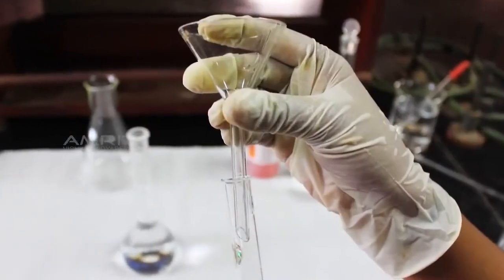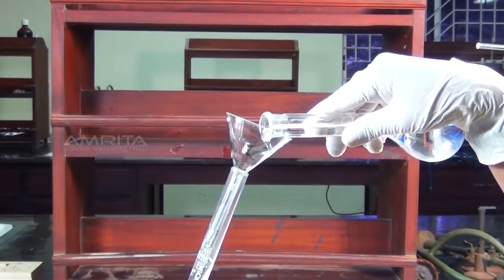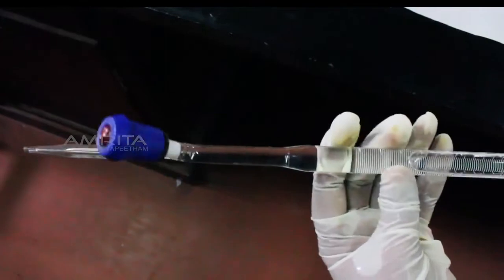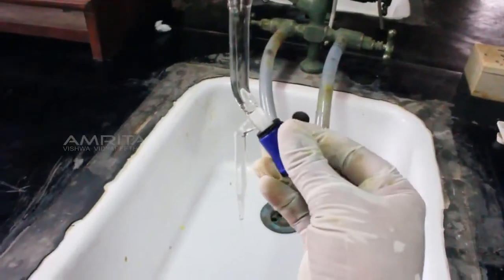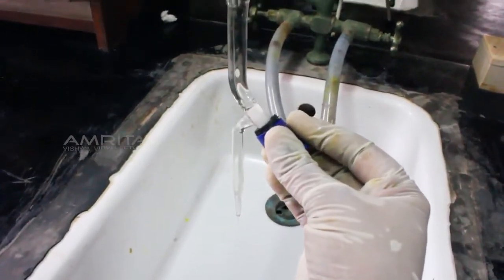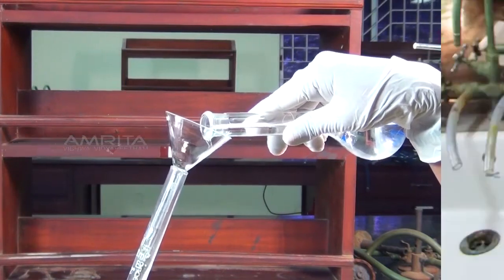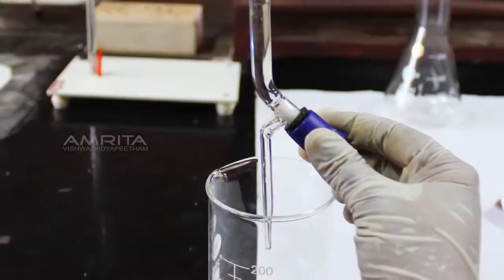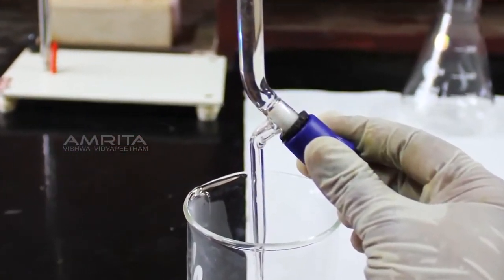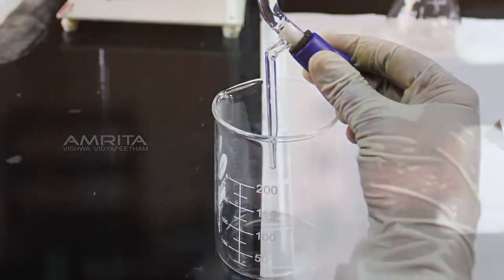Take a funnel and place it over the burette and pour some hydrochloric acid into the burette through the funnel. Rinse the burette 2 or 3 times with the given hydrochloric acid to remove any moisture inside the burette and drain out the washings. Then fill the burette with hydrochloric acid using the funnel. Clamp the burette vertically in the burette stand. Take a beaker and place it below the burette and slowly open the stopcock so that hydrochloric acid is allowed to run out into the beaker and set the initial burette reading as 0.